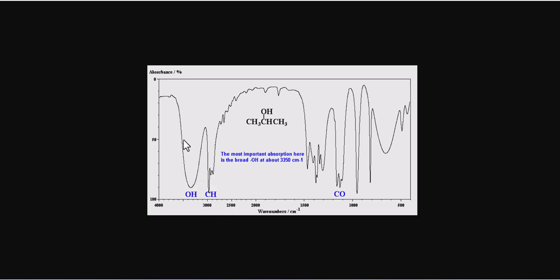We also have our CH bond stretching frequency around 3,000. And then this alcohol peak is very diagnostic. Alcohol peaks are usually broad and strong. They appear around 3,400 to 3,500. And this would be diagnostic of an alcohol, this broad, strong peak at around 3,300 to 3,500.